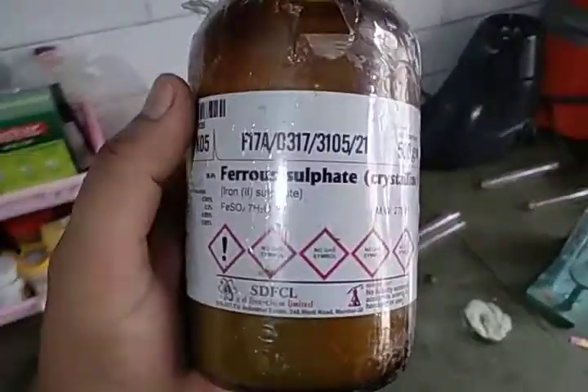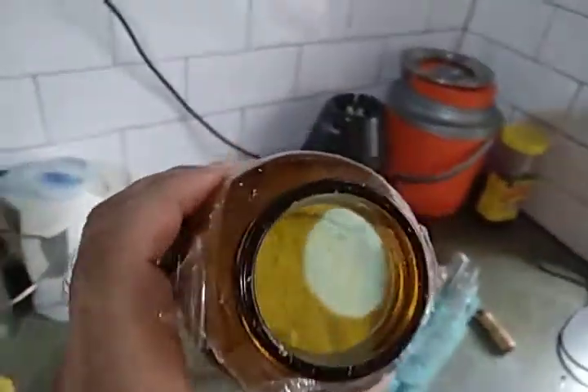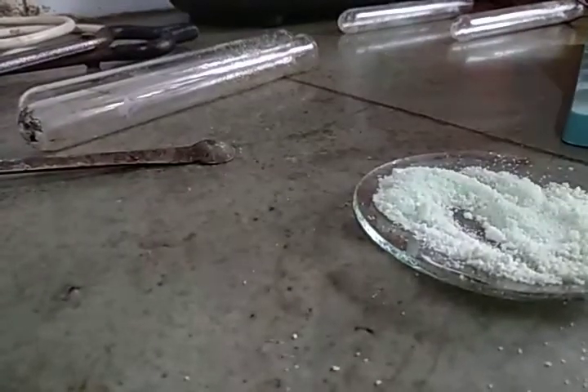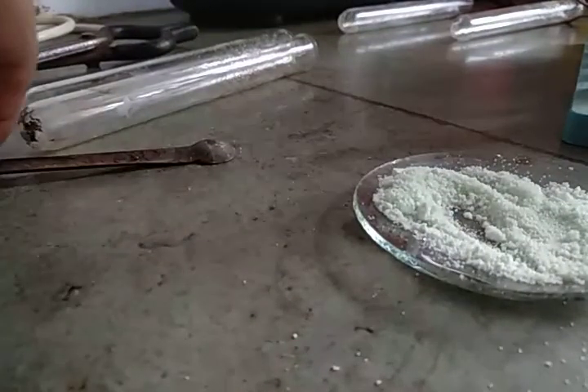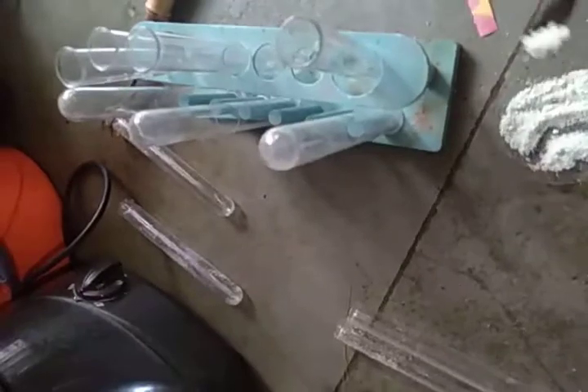Hello dear students, today I am going to show you an activity about ferrous sulfate crystals. These are green colored crystals that you can see inside the bottle. I have taken some crystals outside the bottle and now I'm going to add these crystals inside the test tube.